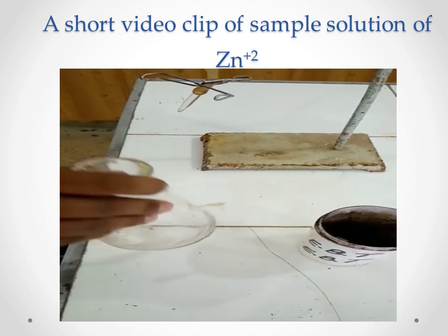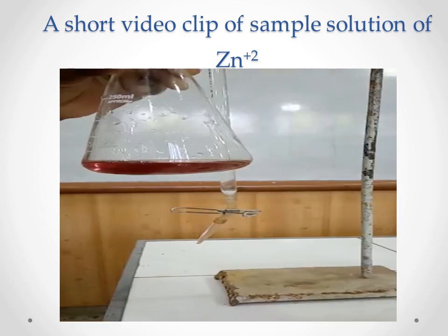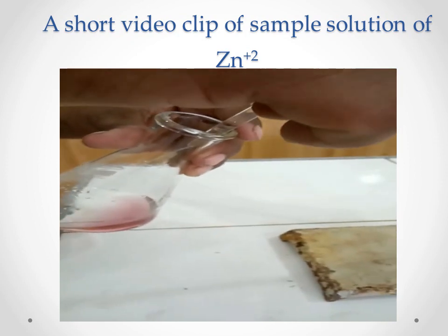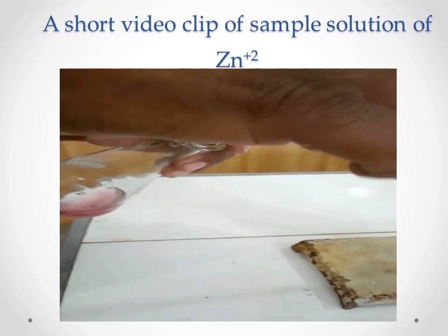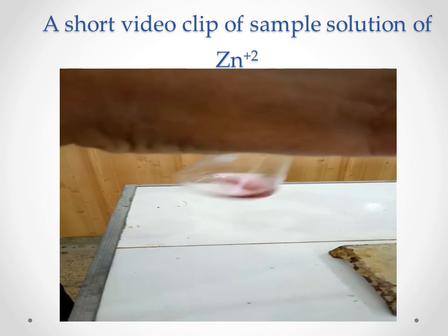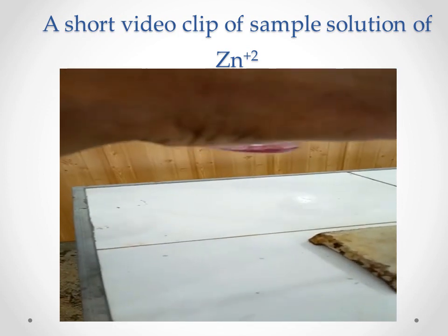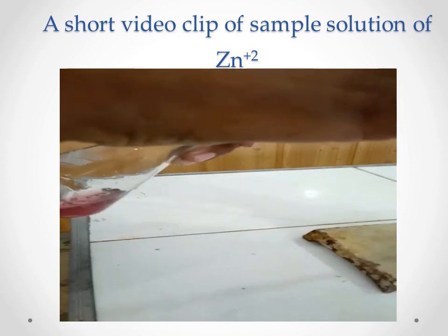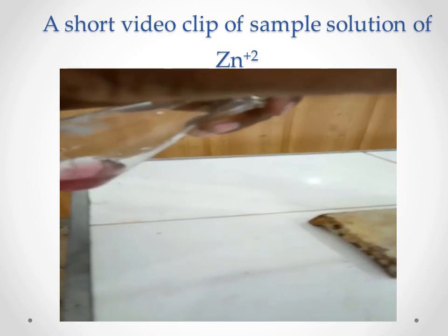Again, have a look at the complexometric titration: the red colored zinc indicator complex breaking down, the zinc EDTA complex forming, and there will be a stage of purple colored complex, and at the end you saw the formation of blue color, that is free indicator.